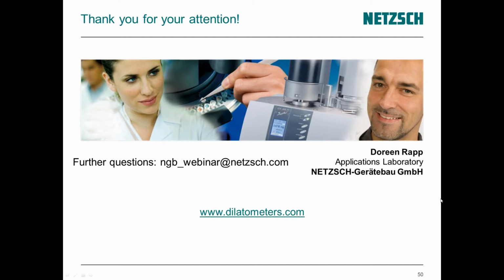So if you want to go down to minus 180 or minus 150 degrees C, then it's better to use helium in this case, but of course you can use also other purge gases like nitrogen or argon. You have to be careful with nitrogen because I know some metal samples might react with nitrogen, and also at higher temperatures, if you go up to 2000 degrees C, for example, you can have the formation of cyanides due to the graphite atmosphere that you usually have in this temperature range.